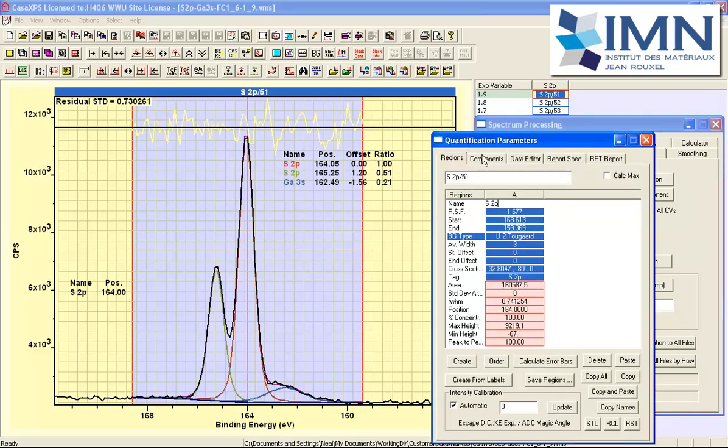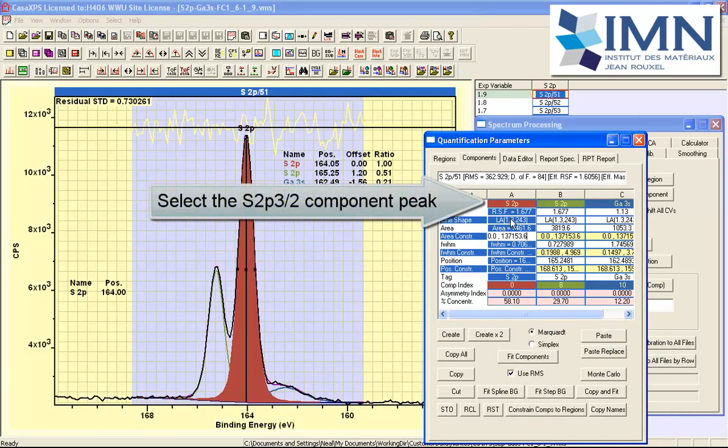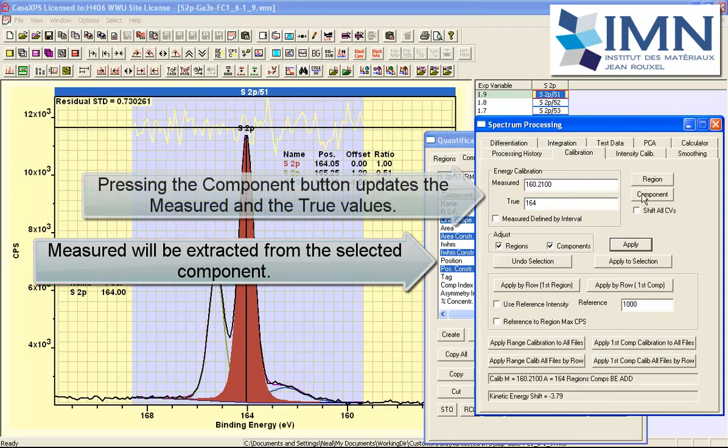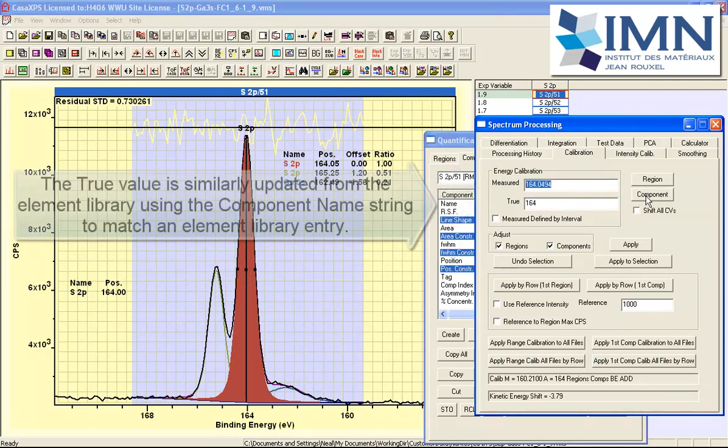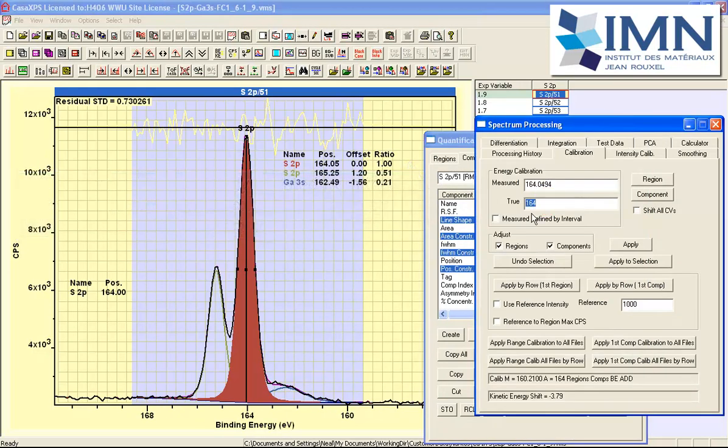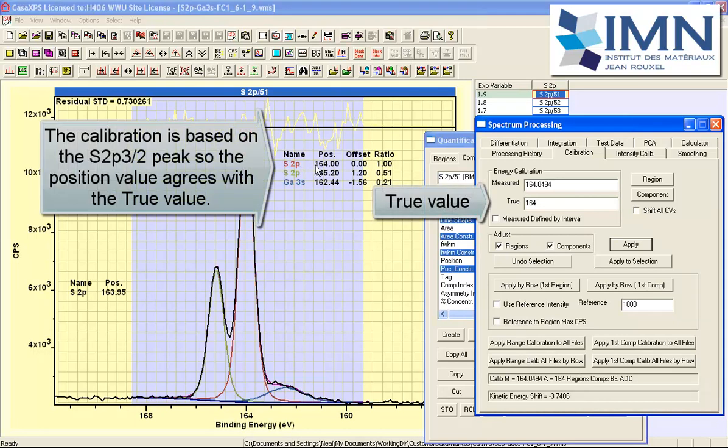So if we wanted to alternatively do the same procedure but this time use the components we would select the component and this is the three halves peak from the sulfur 2p doublet. And once again I go here and I can say component and this time it is brought in the component position not the region position because I selected the component button. And it is again based on the selected component. The true value is once again 164 and we are going to shift regions and components. And we are going to do the apply button so that only the active VAMAS block in the active tile will be processed.